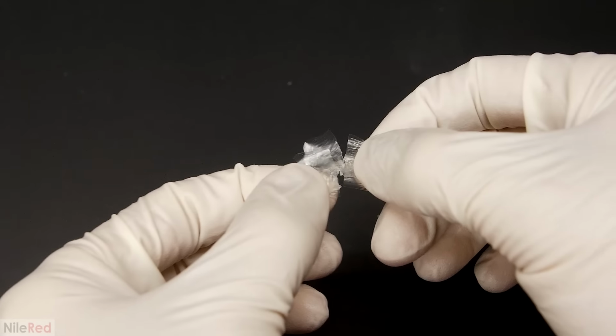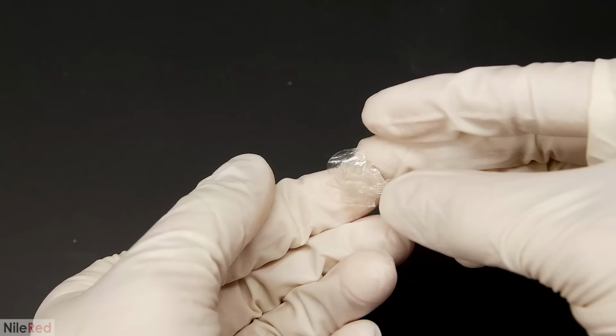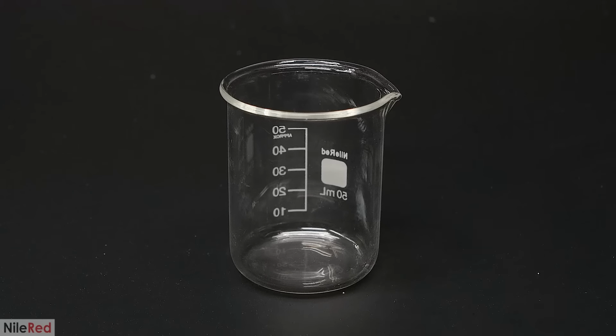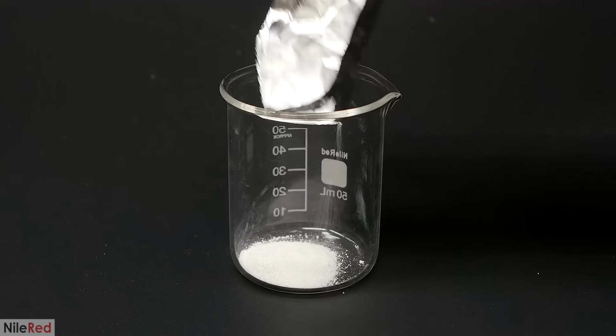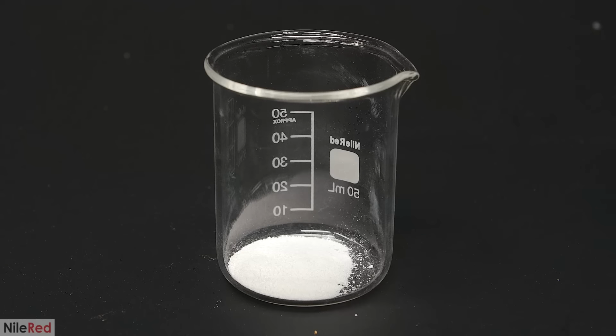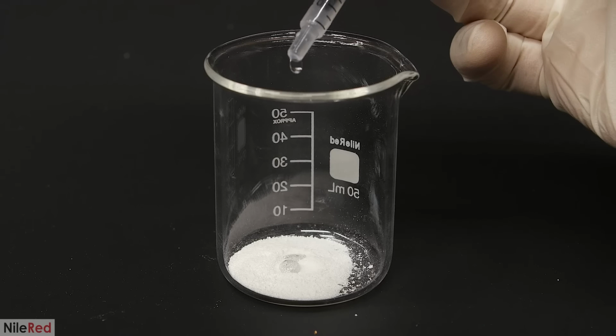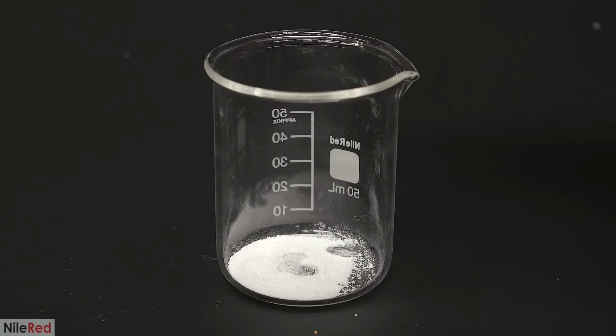Anyway, what I wanted to try next was to see if I could make the plastic less brittle by adding a plasticizer. The phthalate-based plasticizers are the most commonly used ones, but unfortunately I didn't have any. I was able to find a paper though that talked about replacing the phthalates with triacetate, which is something that I have. The triacetate is an acetylated version of glycerol, and it's a lot more environmentally friendly.